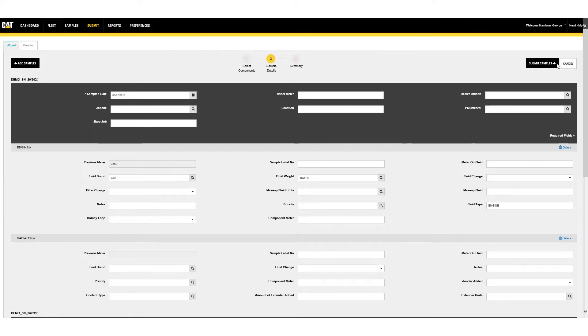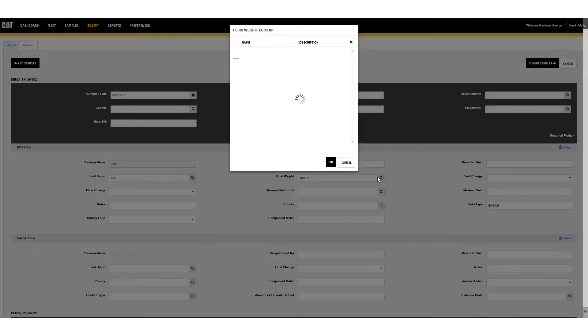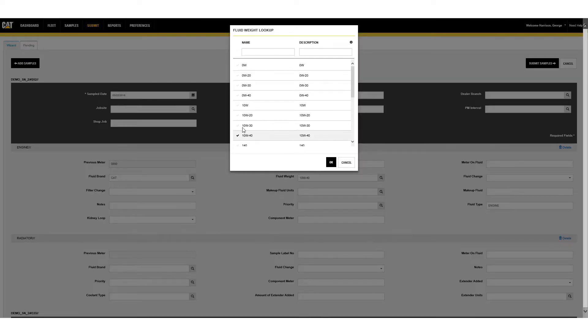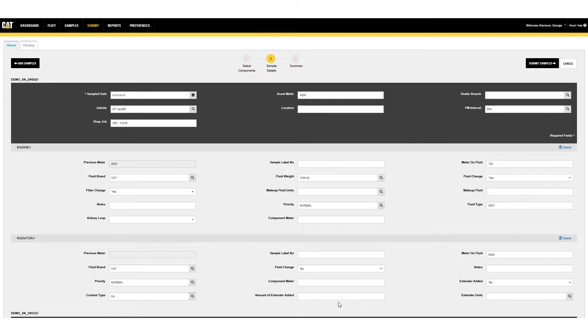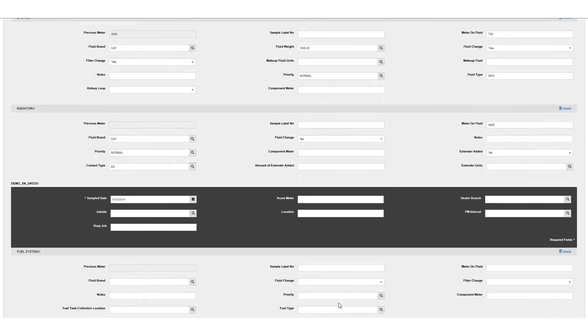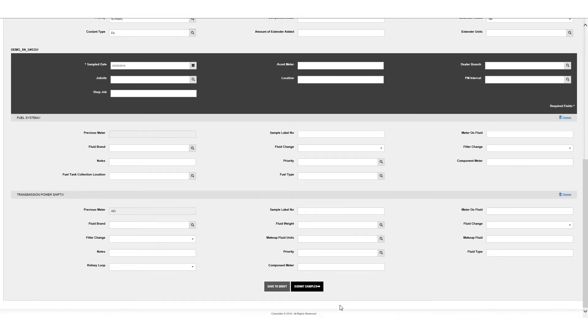Many of the fields have pull-down menus to select from for simpler data entry. Fill out as many fields as possible as more details allow for more controlled sample process testing, better result recommendations, and better fleet maintenance records for future reference.